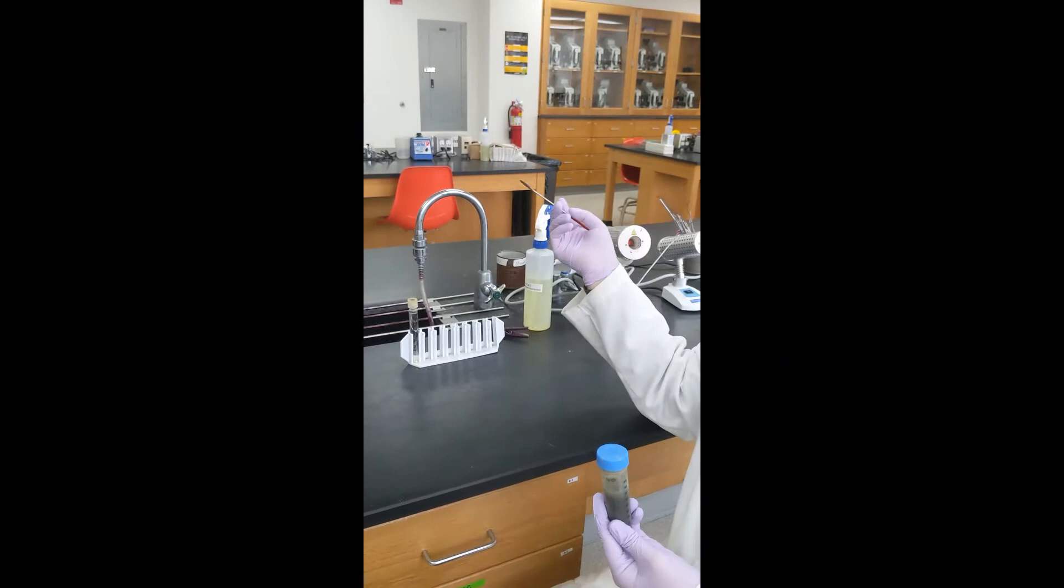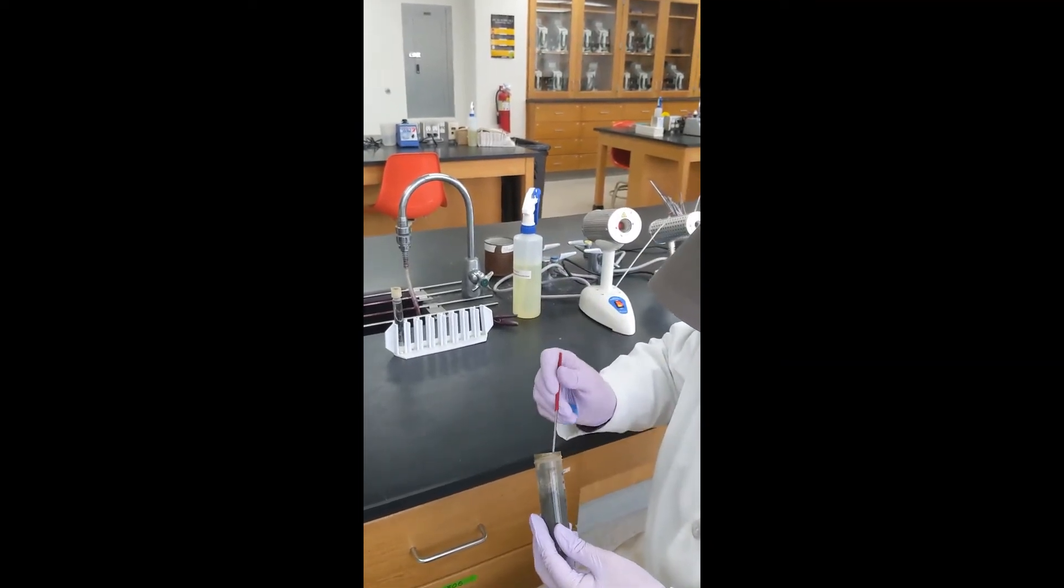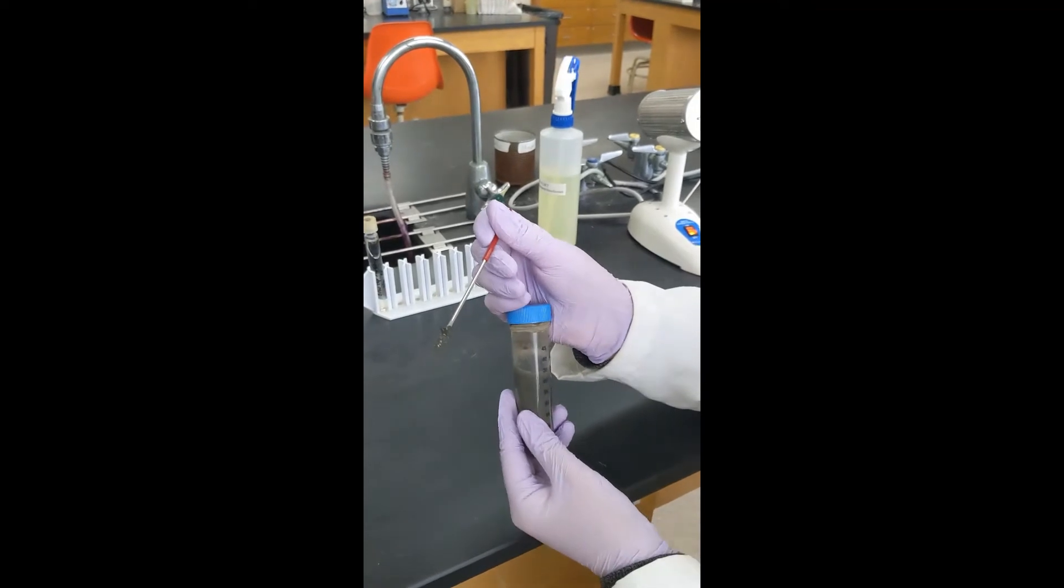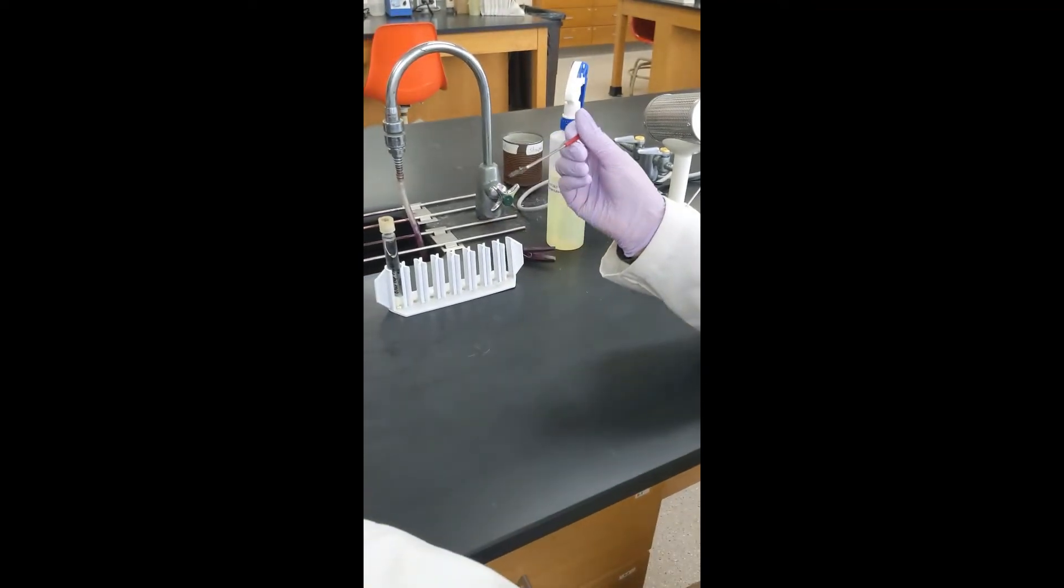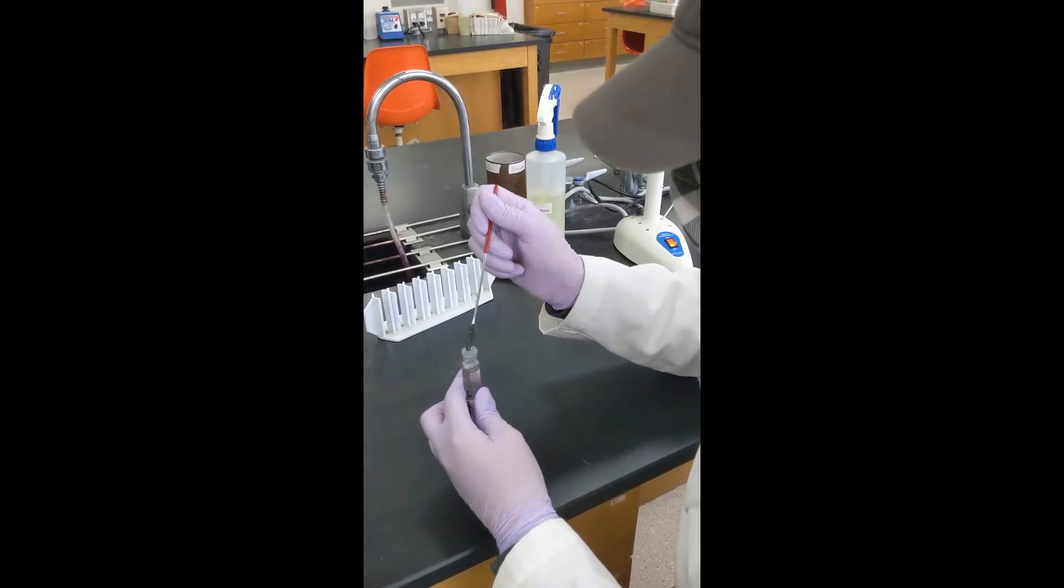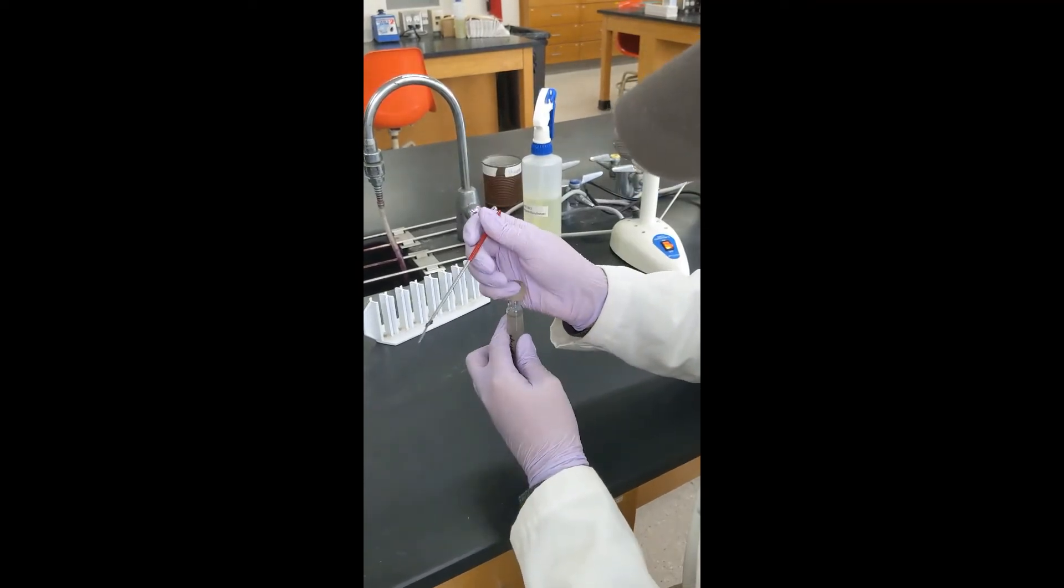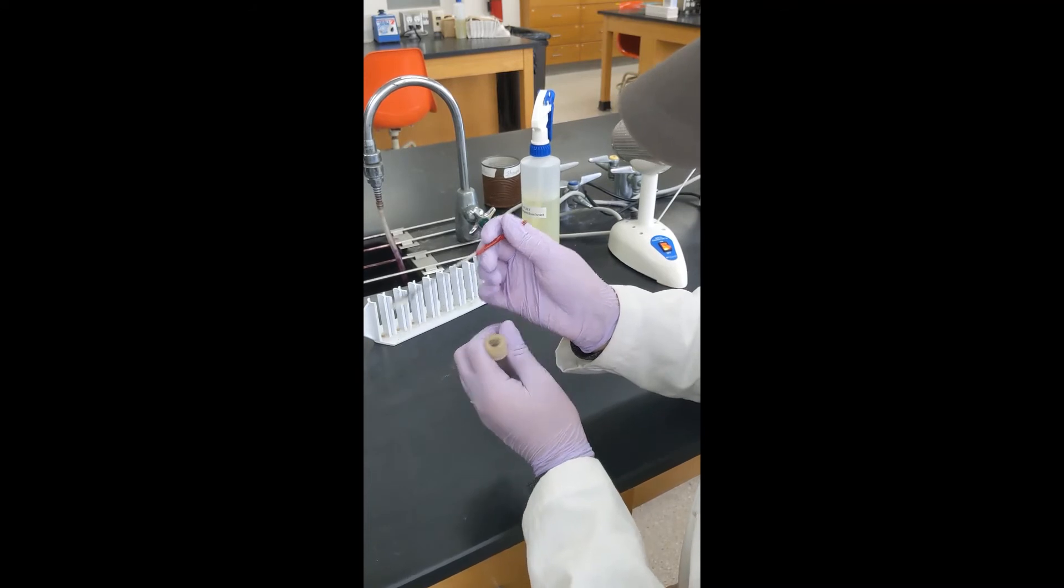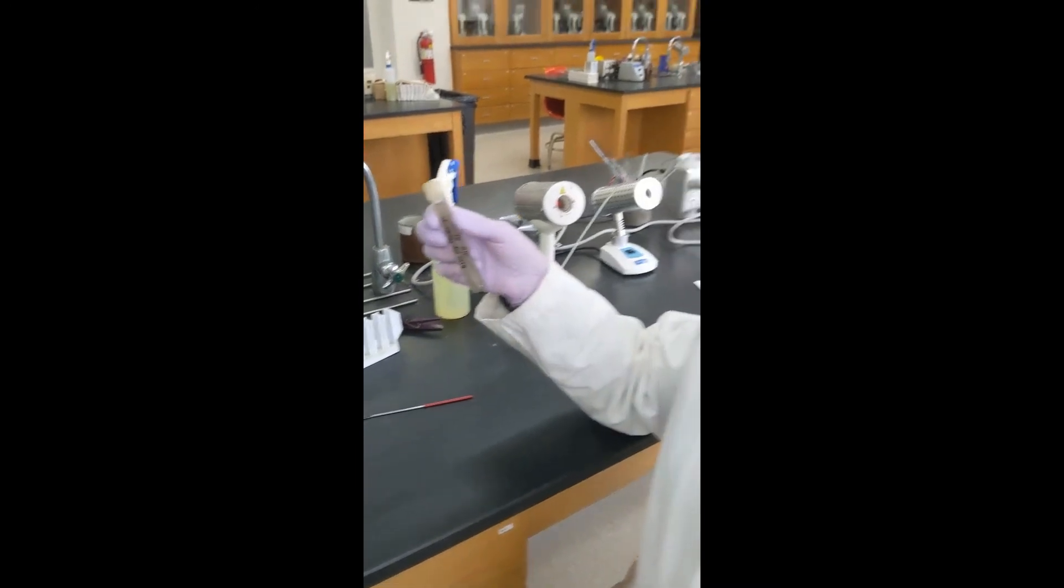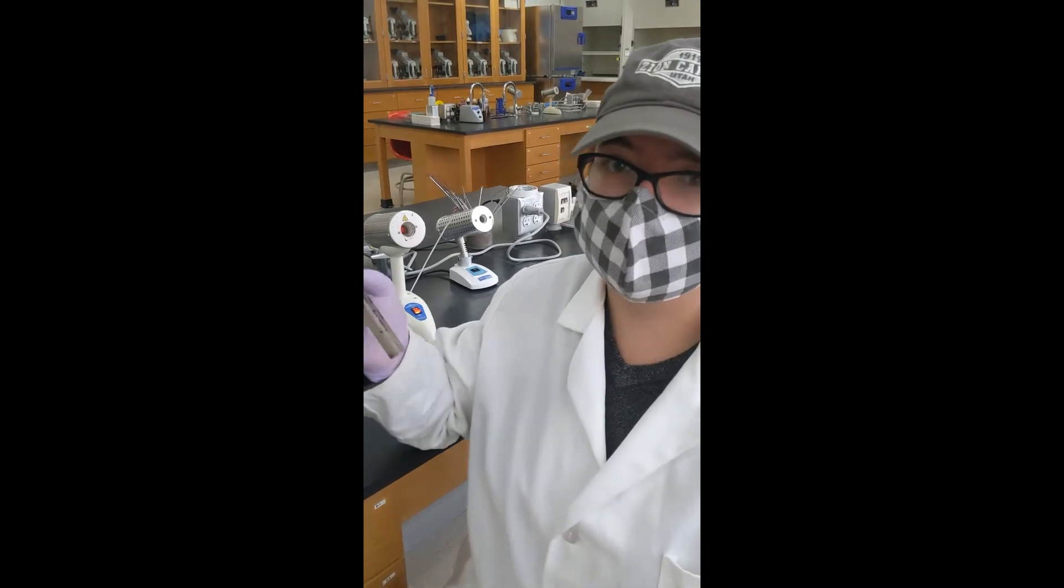So in order to get this set up, all we need to do is take a small amount of our lake sediment, probably just about that much, and stick it right in the tube of Omerod's media, close it up, and invert it to mix it. Then we will take this over to our light setup and let it incubate at room temperature for about two weeks.